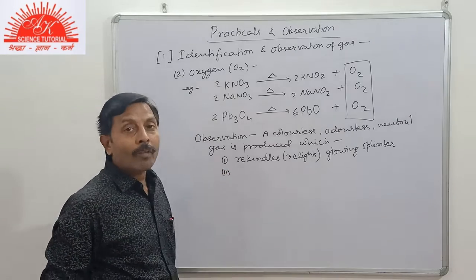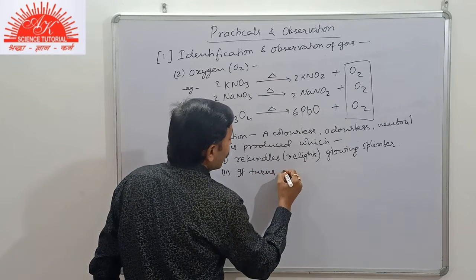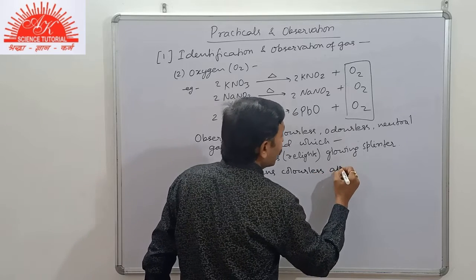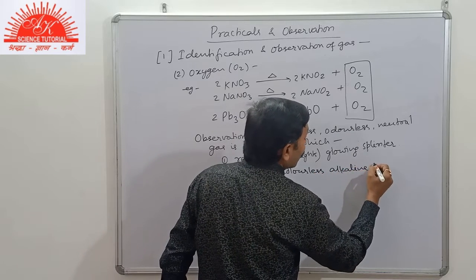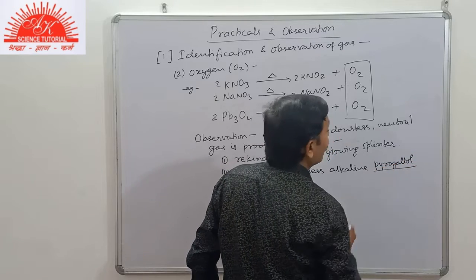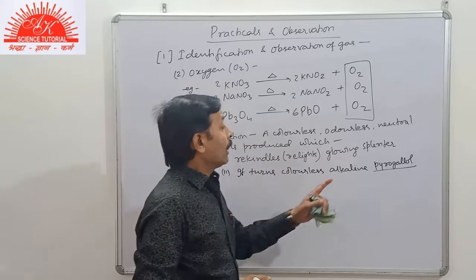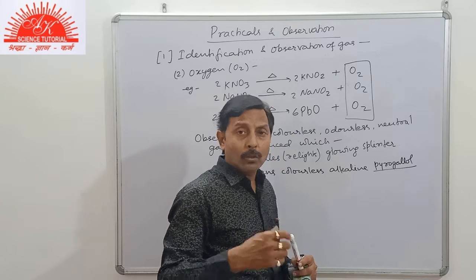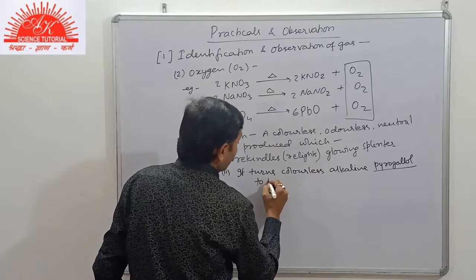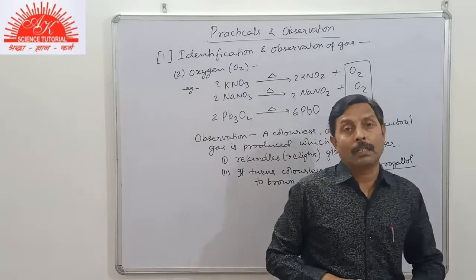First, the test of oxygen. Second, it turns colorless alkaline pyrogallol, that is an organic compound mixture, also called pyrogallic acid, to brown. This is the test of oxygen.